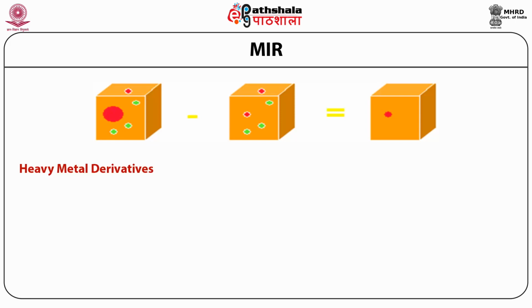Now how do you get these heavy atom derivatives? The simplest, easiest one is soaking or co-crystallization. Because these are heavy atoms and have to enter the crystal lattice, sometimes the crystal is damaged, so many times you lose the protein crystals. With co-crystallization, if you introduce a heavy atom in the crystallization condition, it could change the crystallization condition. So you have to take care of all these things in crystallization or soaking.